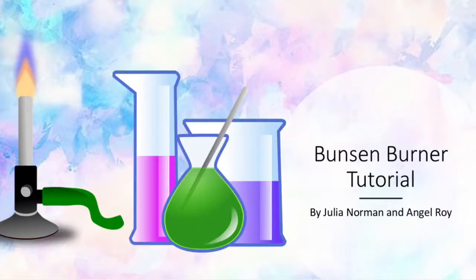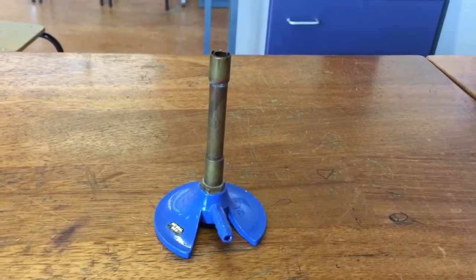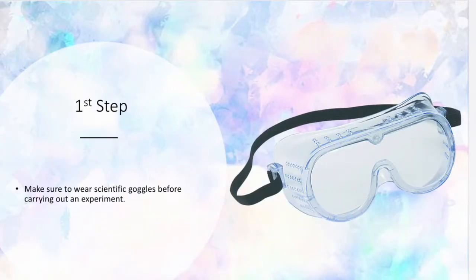Bunsen burner tutorial by Julia Norman and Angel Roy. Equipment needed: Bunsen burner, gas hose, safety goggles, tripod, wire gauze, glass beaker. First step: make sure to wear scientific goggles before carrying out an experiment.